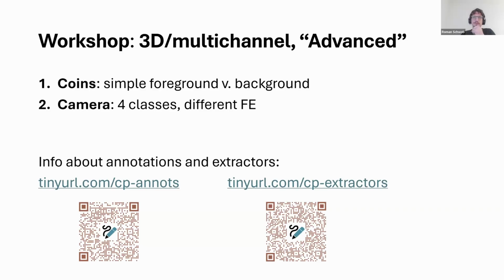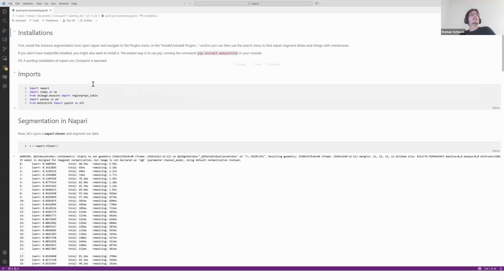Okay, nice. So let's have a quick look then, as I mentioned, at a simple post-processing pipeline.